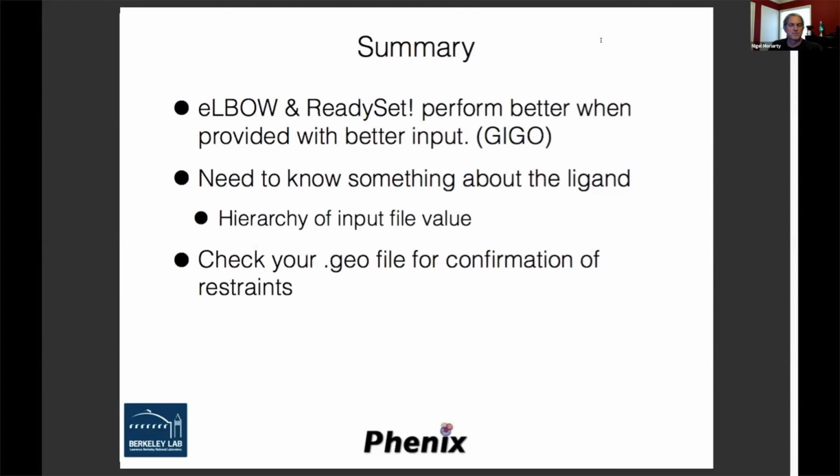Okay. There was a question earlier on that I just want to make sure we got to, which was a little bit related, also from Bonnie. So when automatically creating links to metal ions, is there a good tool in Coot to ensure that the starting model we use has a correct distance between the metal and the side chains? No, I do not know of one. He's just released a new version, which seems to have a lot of features. And besides, the tools in Phenix have an idea of what is a good default distance, which is another thing to keep an eye on.